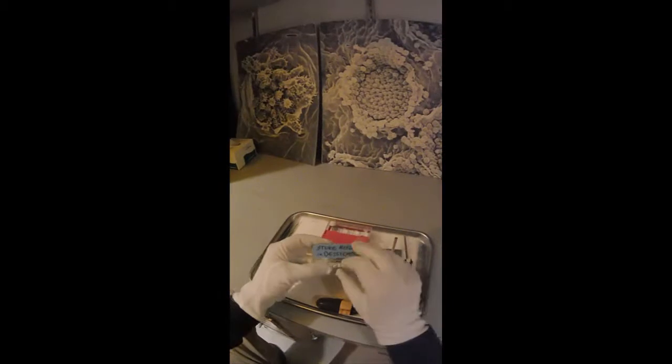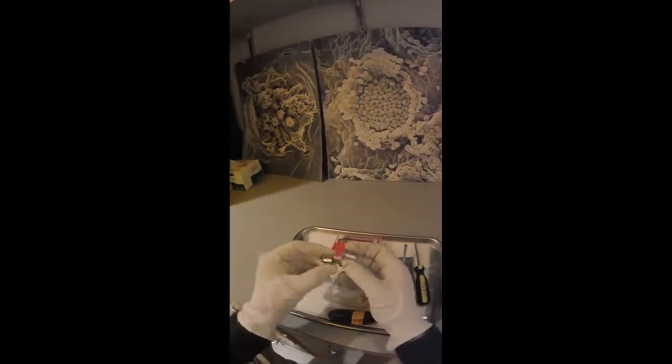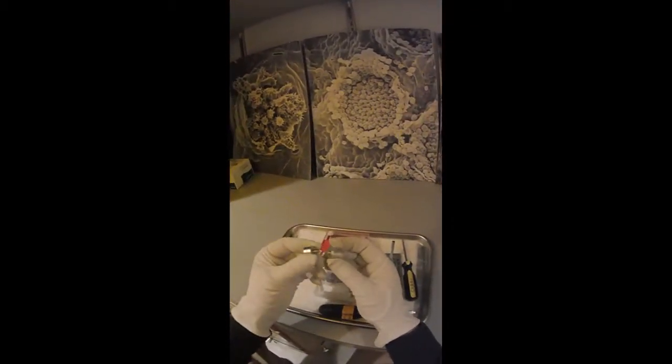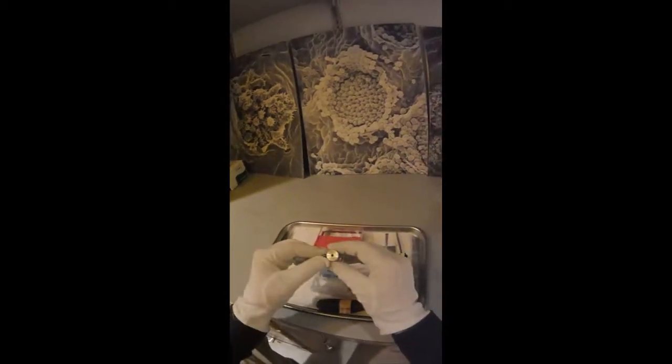The sample holder, like it says, is in the desiccator in the other room and the sample holder is basically a series of lock nuts and a bolt with a set screw to hold the stub in place.